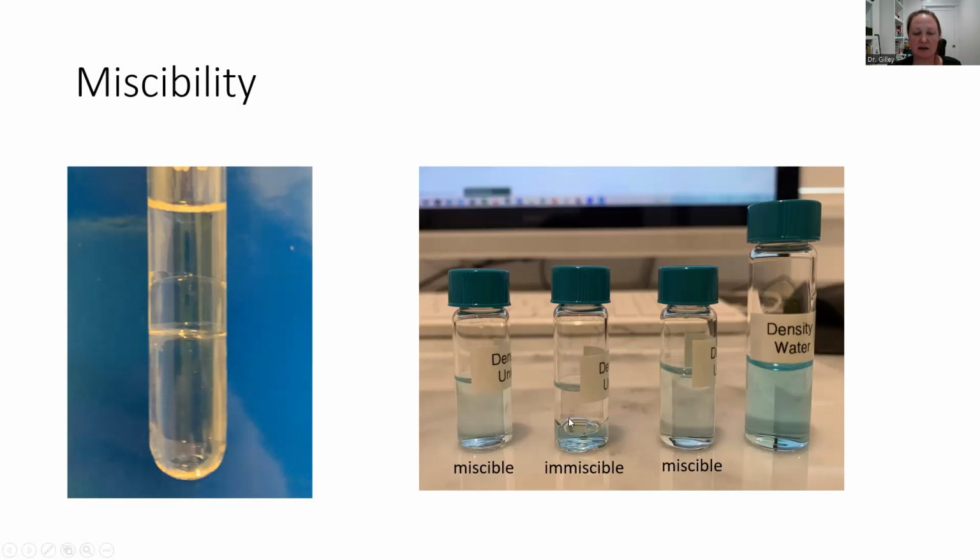There's a clear layer on top and then a colored layer. The colored water is on the bottom. And by the way, this is not A, B, and C. I've mixed those up so that you will have to do your own testing, and not just copy what's on here. So these are in an order, and I very specifically did not show you if it was A, B, or C in this case.